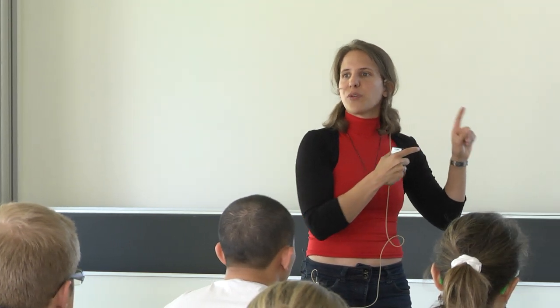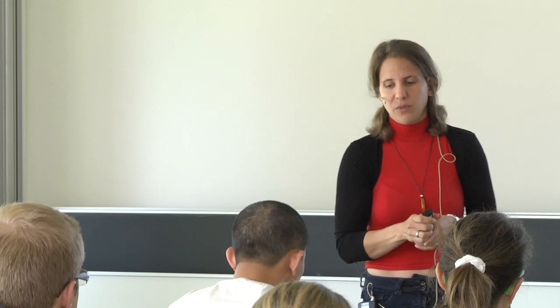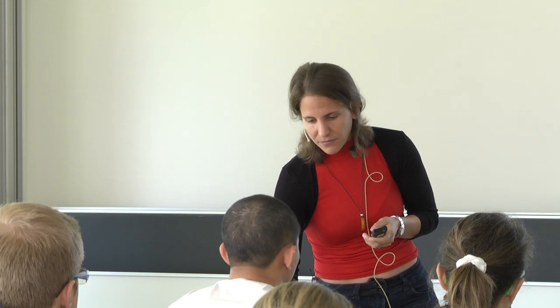So all these are points that are very important to consider, but I don't want to discuss them here, as there will be a whole lecture, and I think several lectures actually upcoming that just focus on this. So there's Olga Witek coming, who's an expert in statistical analysis of targeted proteomics data, and she will go much more into these things with you on Wednesday and on Thursday, I think. But the basic principle, which was important for me, would work like this. This is how you would label-free quantify a protein with a peptide within SRM.